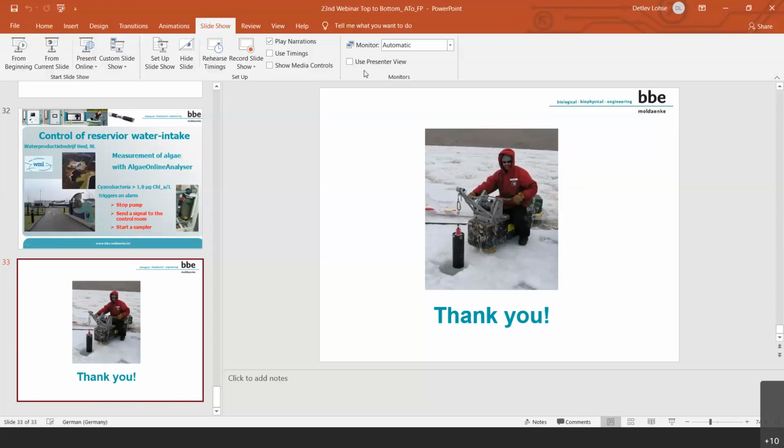So therefore, it is not the goal of this measurement to get the information about the real turbidity. It is important what Tobias already mentioned: we use this for the correction, because the turbidity, like the yellow substance, has an effect on the algae measurements. Therefore it is much more important to get the information about how much it has to be corrected than to know the real amount of turbid particles.